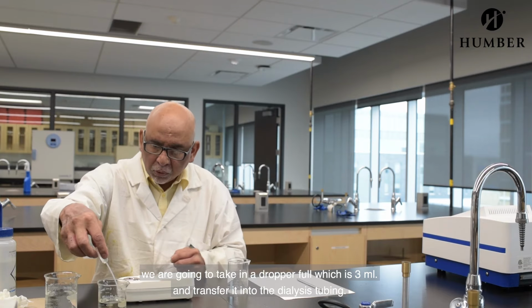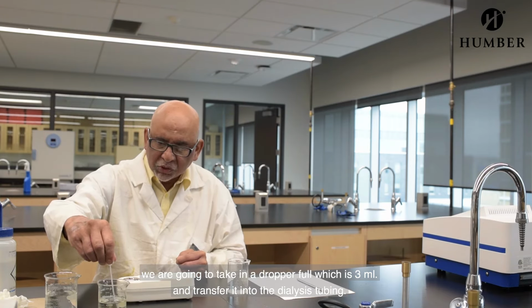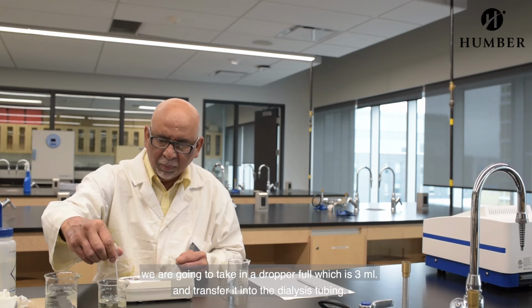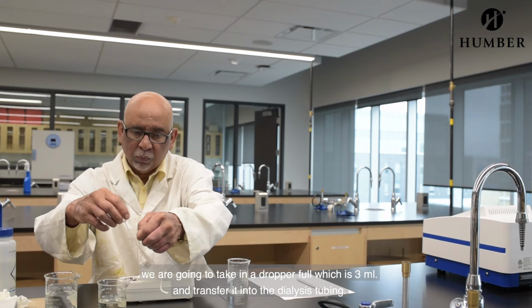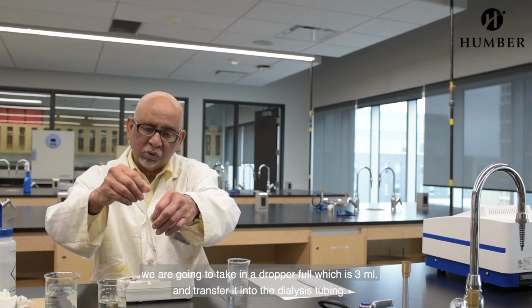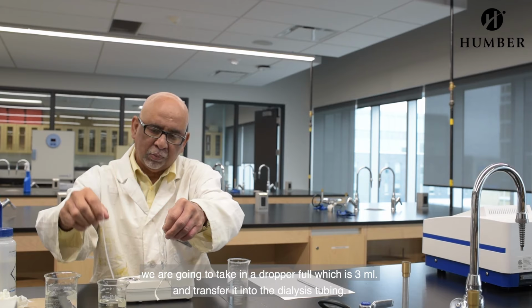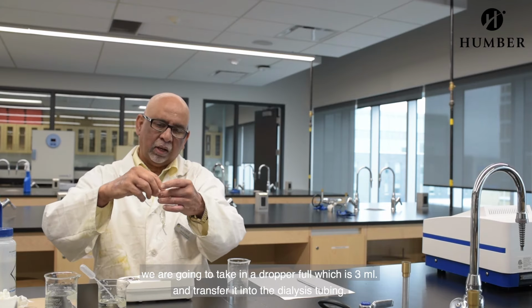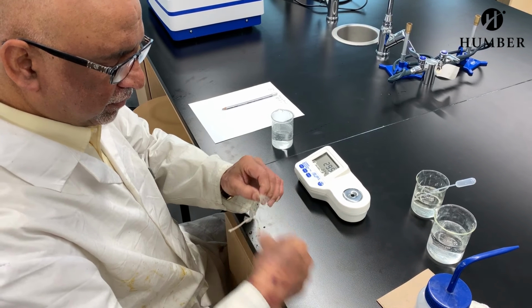We know our starting sugar solution is 29.5%. We're going to take in about a dropper full, which typically I've checked is about 3 mils. And there are some which have markings, and you could use that as well. I'm going to fill that up to about 3 mils. I know my starting is 29.5.